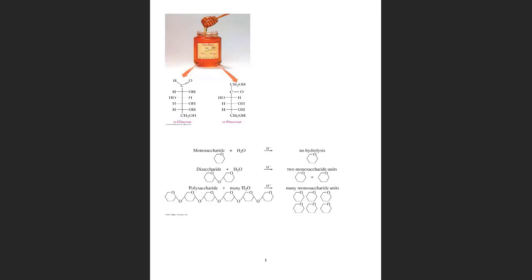Welcome to the Labflow workshop, experiment number 10 for 1406, which is carbohydrates. Let's start by saying what carbohydrates are. I will give you a quick overview of carbohydrates, and then we will go over the report to make sure you know how to complete the report.